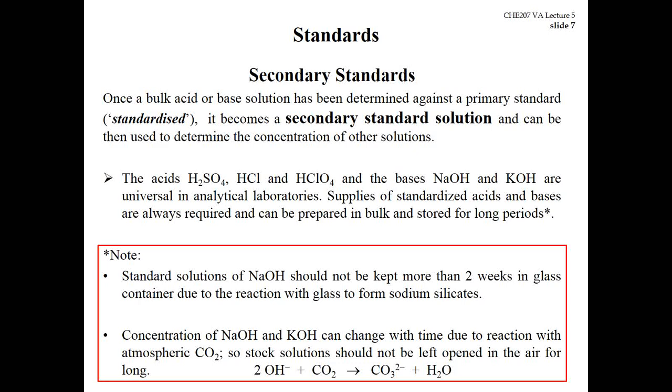Therefore, the stock solution should always be kept in a tightly closed container and only opened when needed. We've got to try to minimize the time it has contact with air.